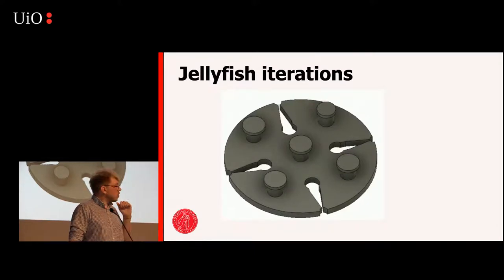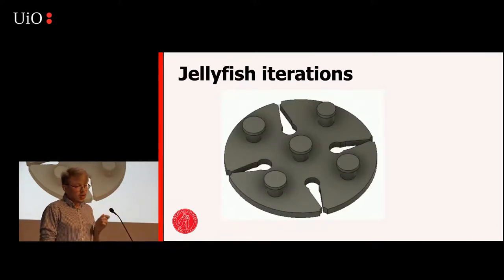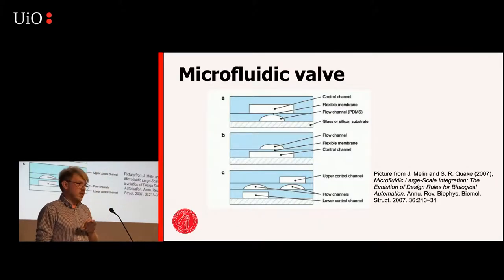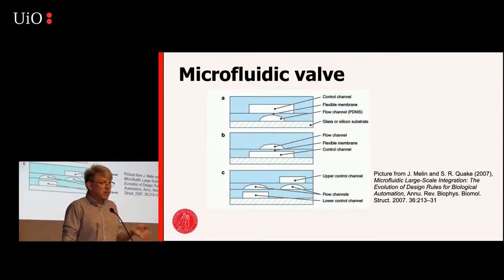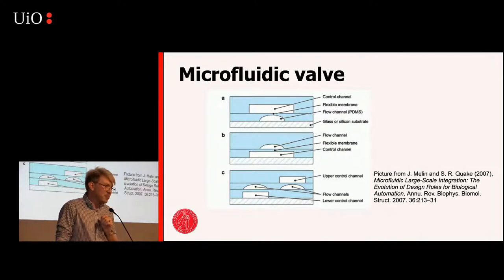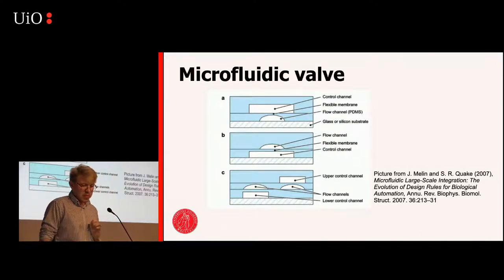And something we've been talking about internally and with Kayoko, our supervisor, is to make a microfluidic valve. Now, microfluidics, you're going to hear more about later, but we think it'd be really cool to make a valve that can open and close using a muscle cell. This is a traditional microfluidic valve. It uses a pressure system, but we think it'd be cool to use muscle cells instead. And it has never been done before. We have no idea how to do it. It's probably really hard. It would be a challenge, but we think it could be fun.